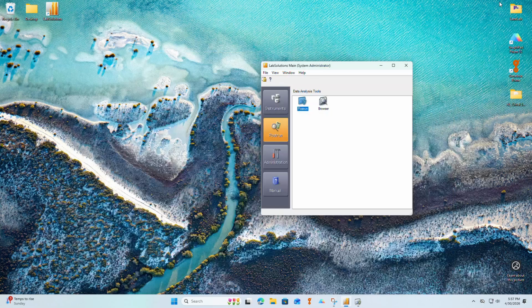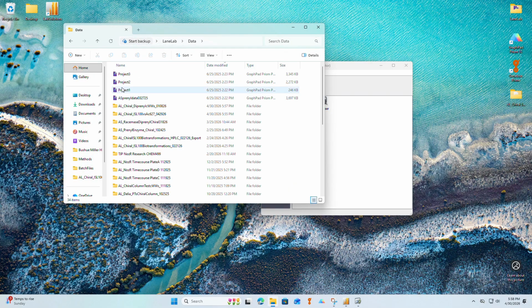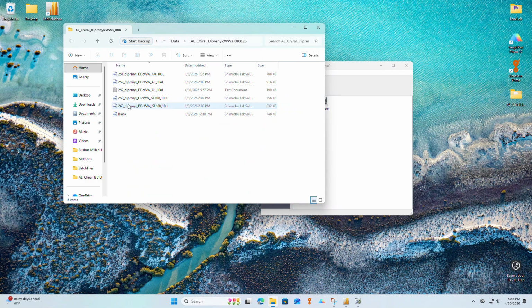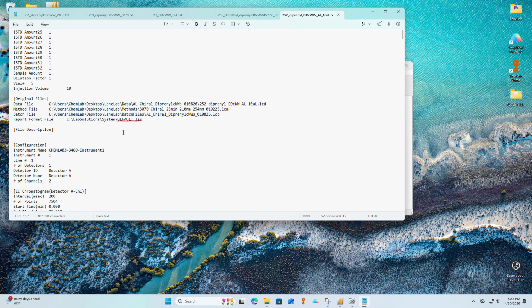So now that we've done that, I want to double check that we did actually indeed save this and that it's formatted properly. So I come over to where I saved that text file, find my way to that file here, getting into that folder. Now I have my text document file type and I double click to open this. You'll see at the top is the information about the experimental run. We come down a little bit.